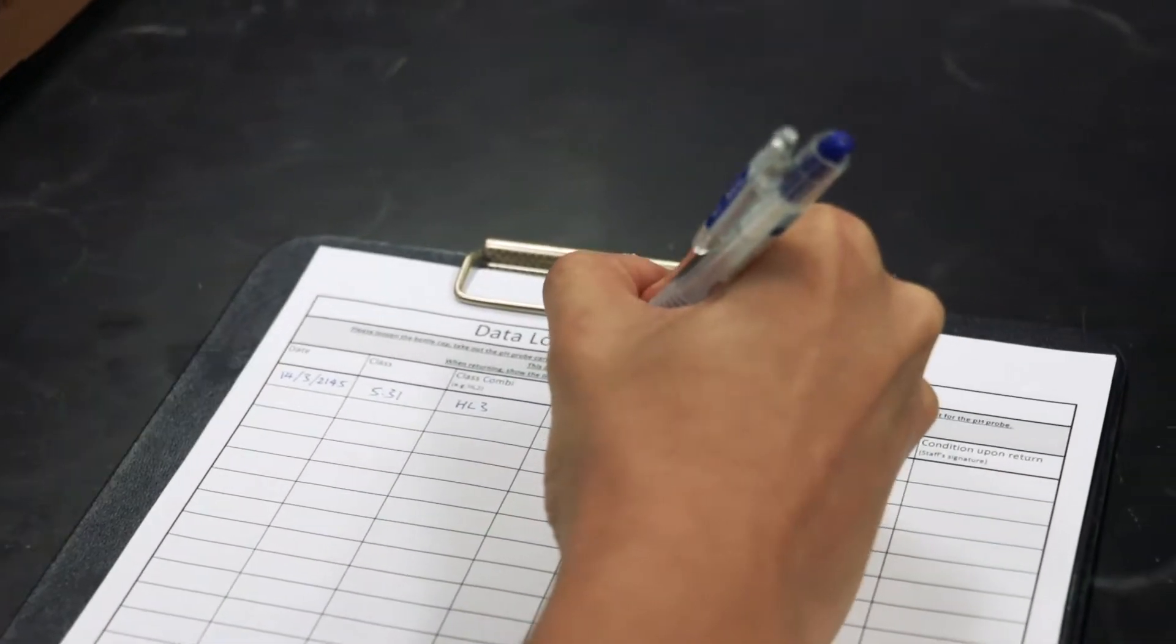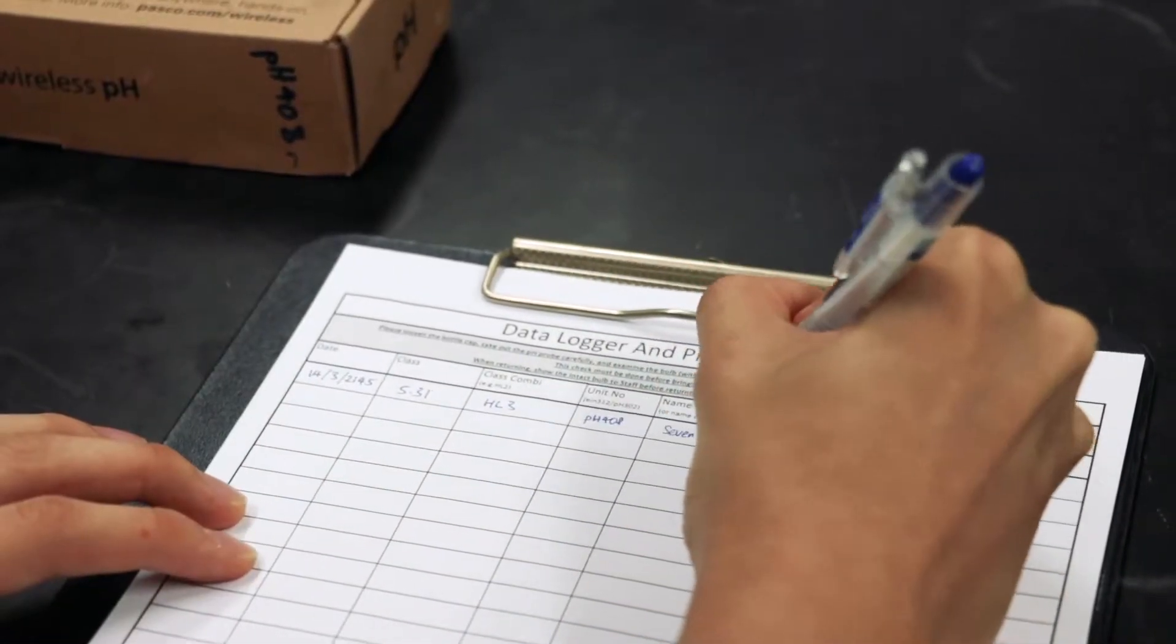Firstly, sign out the PH Probe by writing your name, class and the PH Probe CO number.